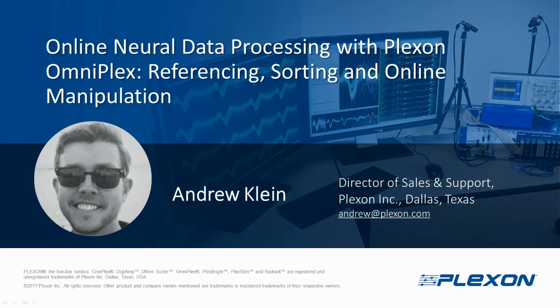Today I will be demonstrating some of the OmniPlex software features. OmniPlex is Plexon's flagship neural data acquisition system.